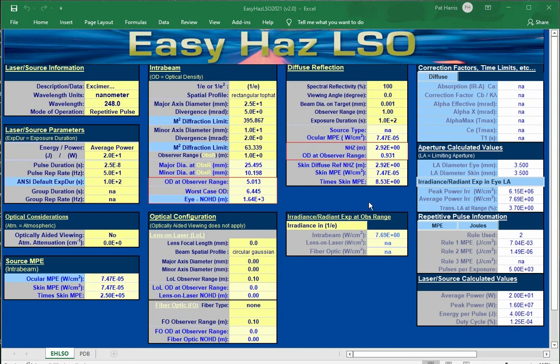In this analysis, we're going to look at an excimer laser. This is a pretty popular laser in research, particularly in chemistry, and it's because you can get different UV wavelengths out of this by changing the gas mix. And these UV wavelengths, having high energy photons, can break molecular bonds, and so it's a pretty popular use in chemistry.